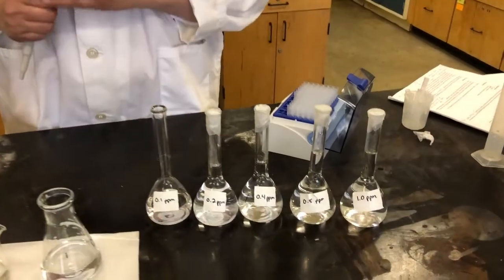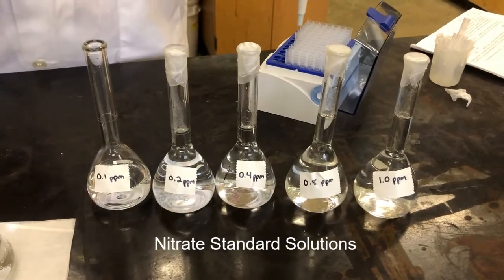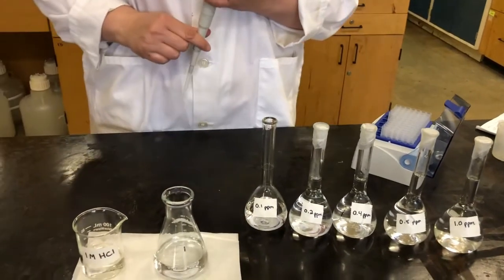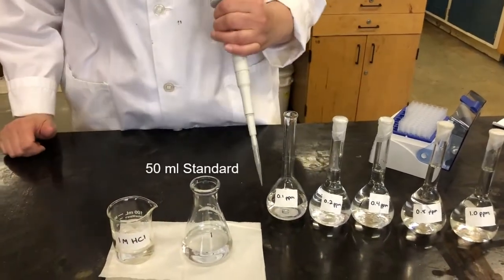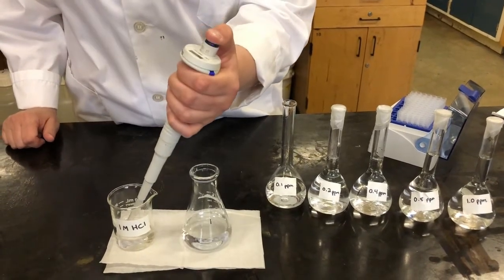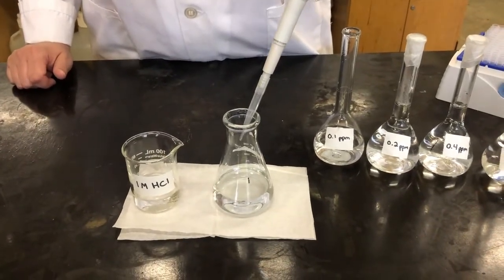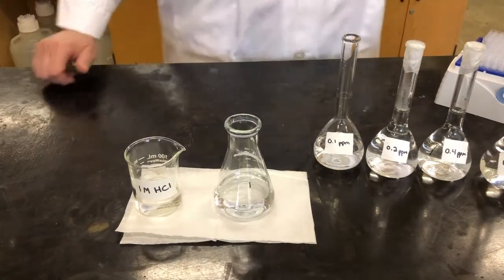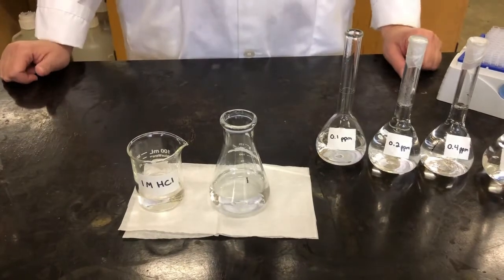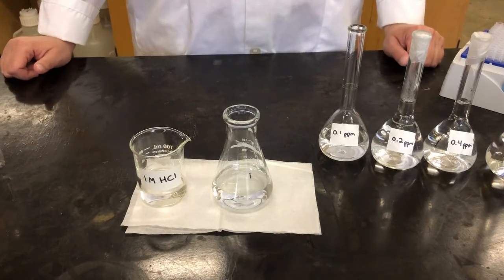So I have a series of nitrate standards. And again, we're going to start with the lowest one, the 0.1 ppm. Take 50 milliliters of the sample again, and that's already measured out here in this Erlenmeyer flask. So that's 50 milliliters of the 0.1 ppm solution. And to that, I'm going to add 1 milliliter of 1 molar hydrochloric acid. Okay, so now I'm going to do the same thing for all of the other standards, and then we will measure those on the spectrophotometer as well.